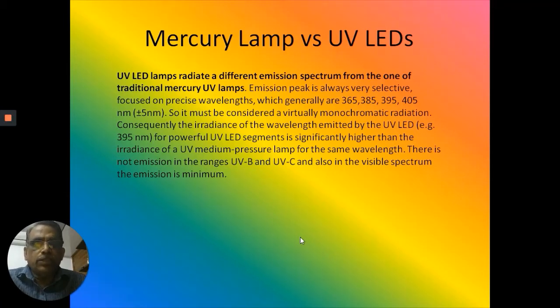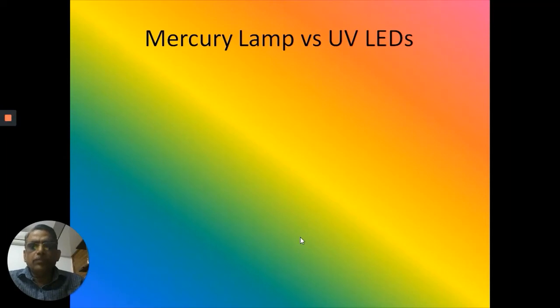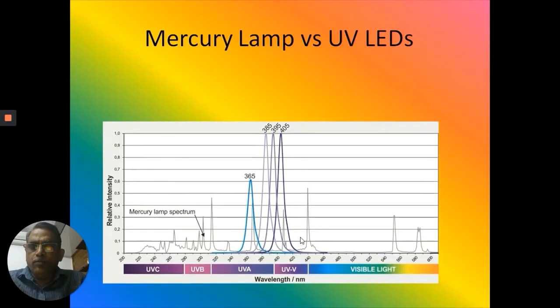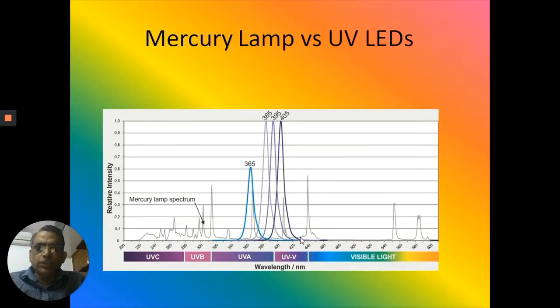As you know, you will have a spectral width of around plus or minus 5 nanometer around these lines. They're all monochromatic, UV lines are available, and you can have a choice of UV LEDs also. Now when you look at the spectral distribution of all these LED light sources, they cover the visible, as I already mentioned. You can also have the LED at 365, which is called the UVA region.